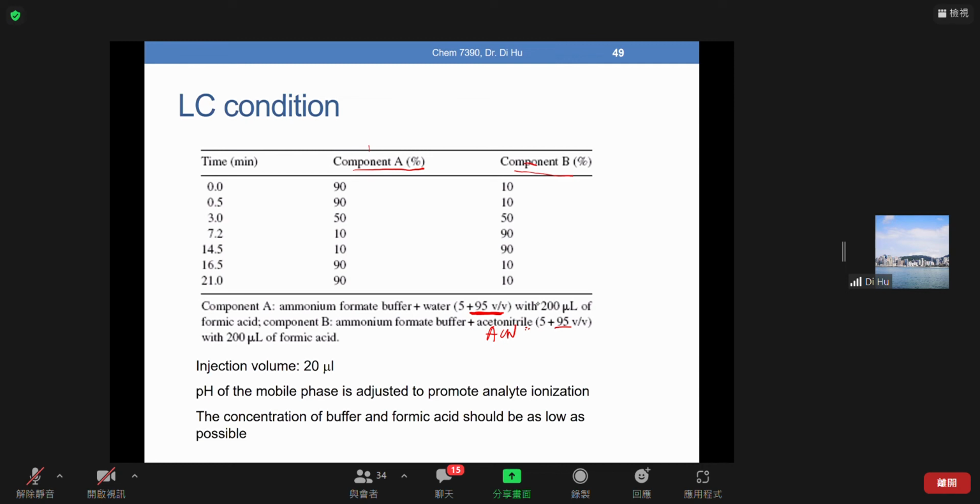So we mentioned something like isopropanol, IPA, that one can be used. And THF, we mentioned that already, right? They can provide pretty good elution strength. However, for IPA, isopropanol, its application is kind of limited because of its high viscosity.